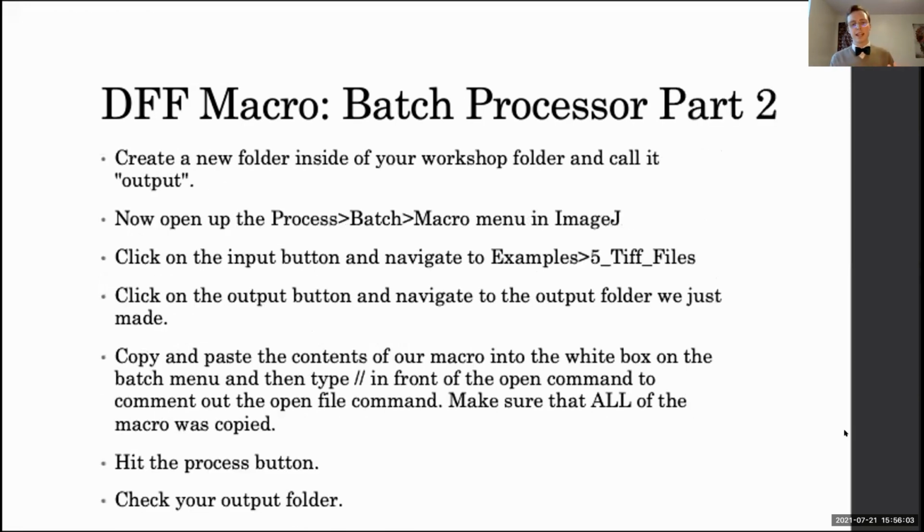All right, so once again, I'm going to give you about 5 minutes to try to work through this on your own. If you get stuck, that's no problem. As soon as the 5 minutes are up, I'm going to do a walkthrough where I'll go through this step by step, and we can figure out any places where something may have gone wrong. All right, so I'll put about 5 minutes on the clock.